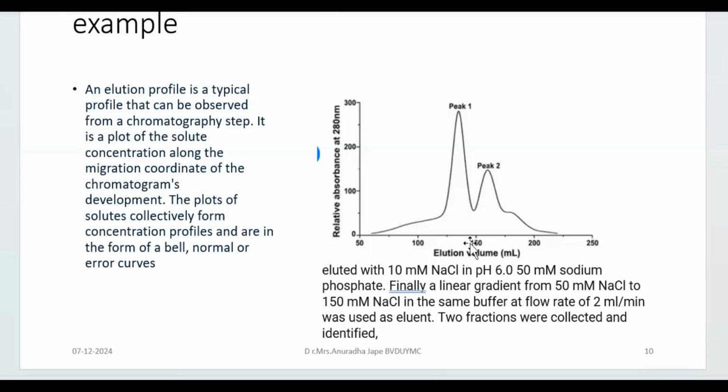Of course, when you are adding some salts to the sample analyte, maybe the absorption properties of your analyte will also change and its lambda max may also change, right? So it may give you separate peaks with change in gradient, and at what particular mixture combination the analyte appears earliest, right?